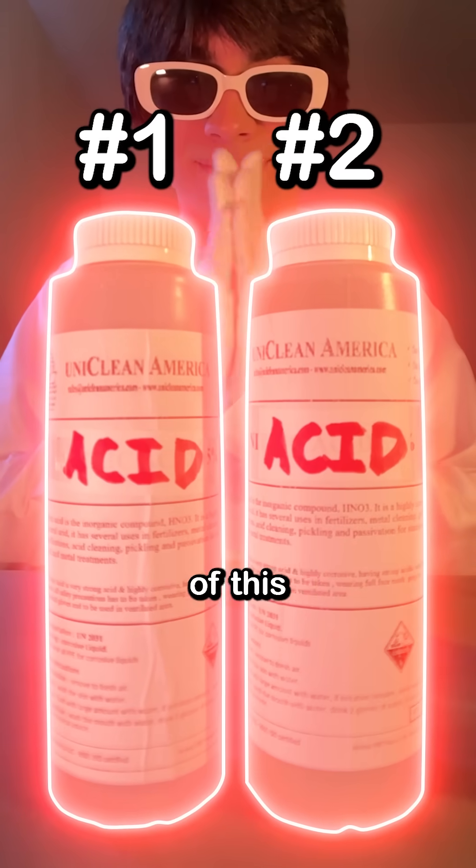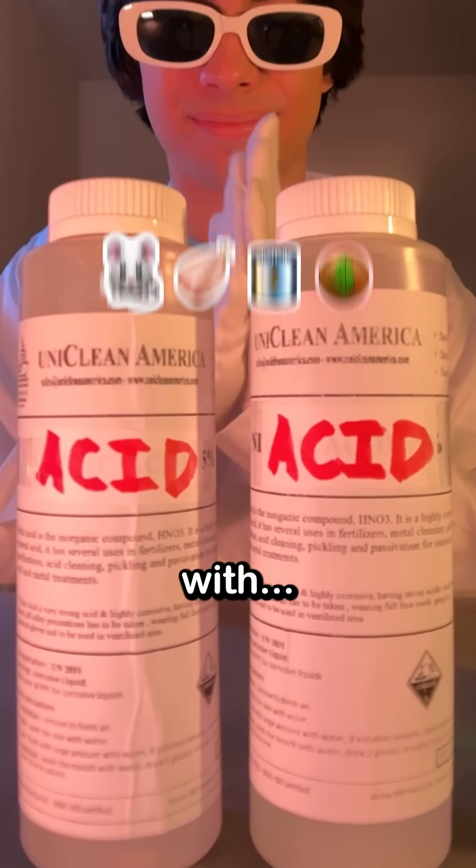Since I bought a ridiculous amount of this toxic acid, we'll start easy and work our way up in hardness.